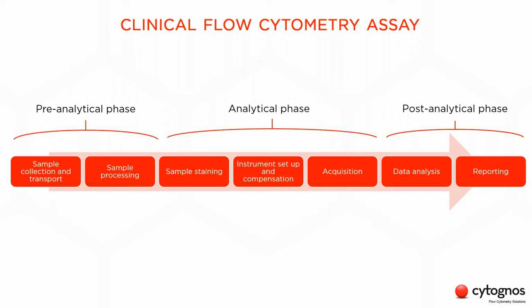So there are multiple checkpoints here where we can introduce errors, especially in the pre-analytical and post-analytical phase. And these errors have economical consequences and negative effects in patient care. And that's why all flow cytometry assays require careful assay design, instrument setup, performance validation, and ongoing quality monitoring.